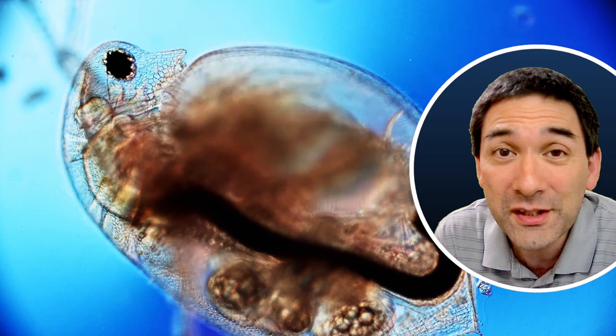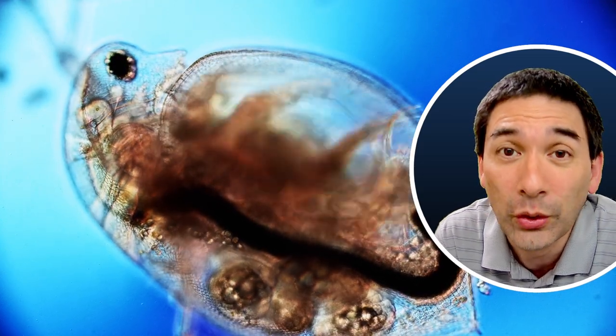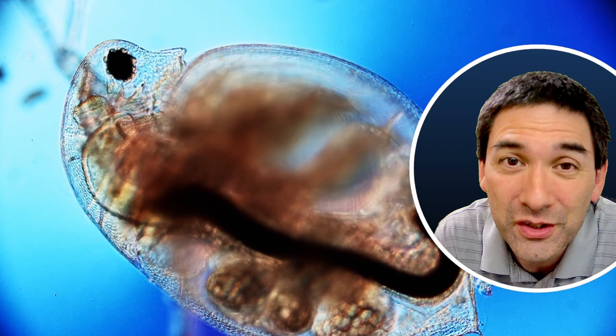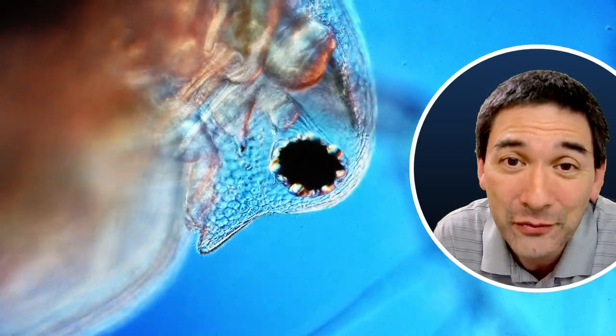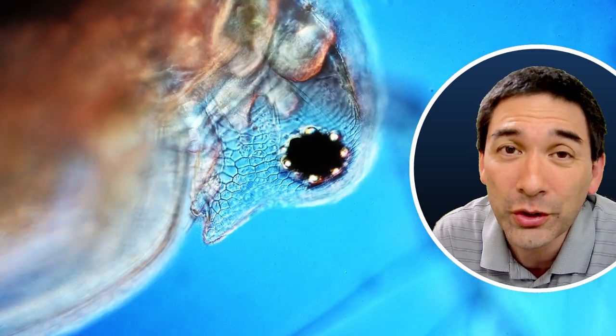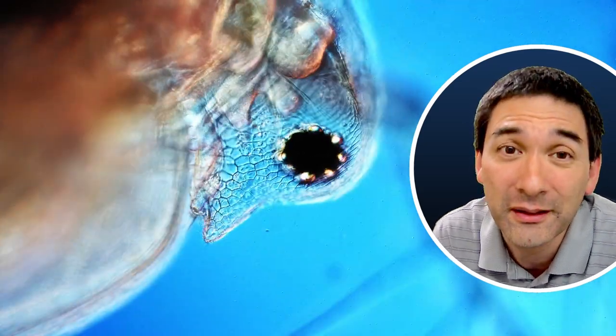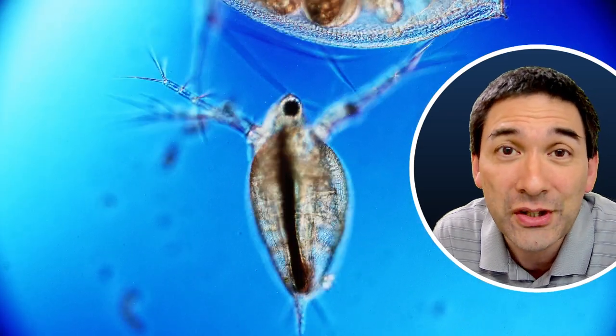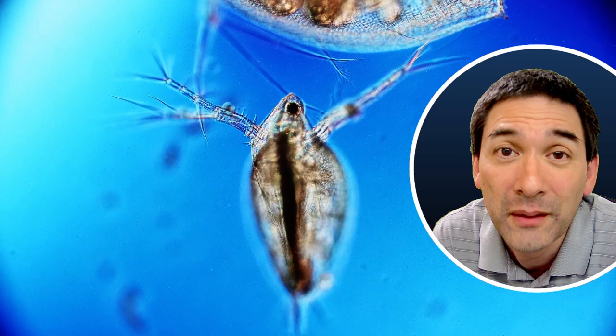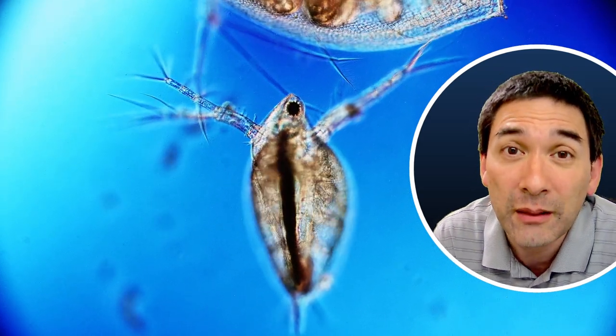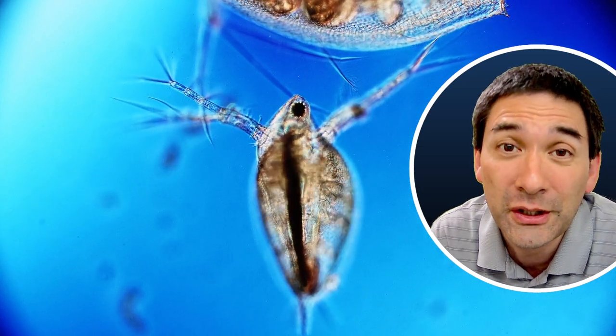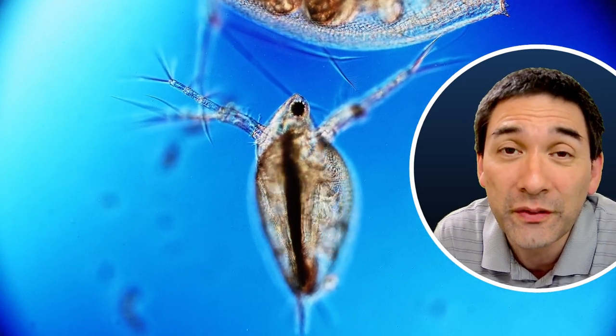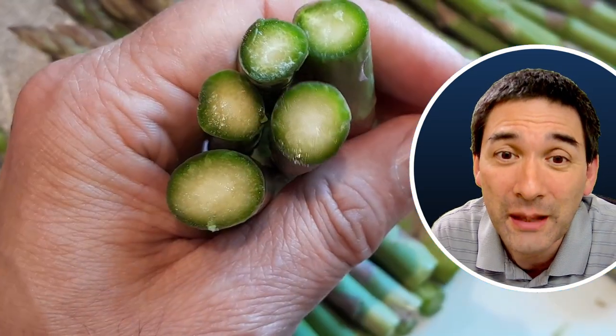I also went into the forest. I found a puddle there, some standing water, and it was full with water crustaceans. So I took a sample home and of course also put it under the microscope, and I found several species of water crustaceans, water fleas. And they basically were reproducing happily because I could see also quite a few of the larvae. That's a larval stage. They have a different shape but at the same time they are of course also significantly smaller. So there were several generations of these water crustaceans present in the water sample.